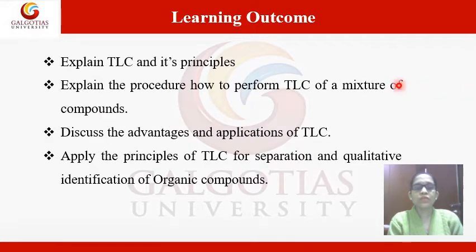So what are the learning outcomes after the class? Each and every student should be able to explain what TLC is and what the principle of TLC is, explain the procedure of how to perform TLC of a mixture of compounds, discuss the advantages and applications of TLC, and apply the principle of TLC for separation and qualitative identification of organic compounds.